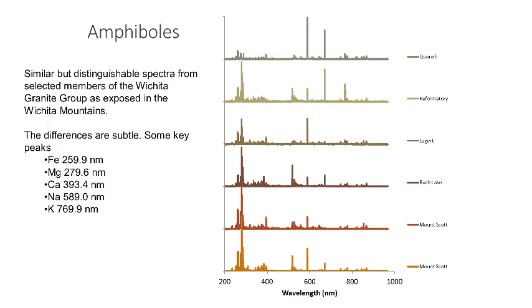Seeing these differences can be somewhat challenging, so the LIBS technique has its limitations in that we know what elements are there, but it can be difficult to say how much of each is present. The instrument is most useful for discriminating differences and pointing out and highlighting those differences.